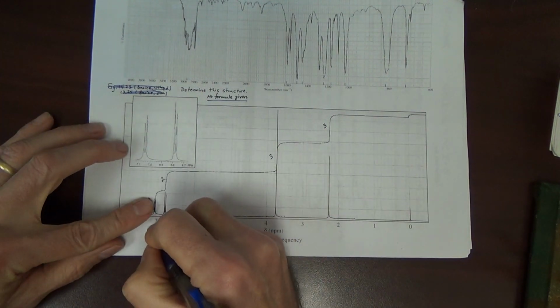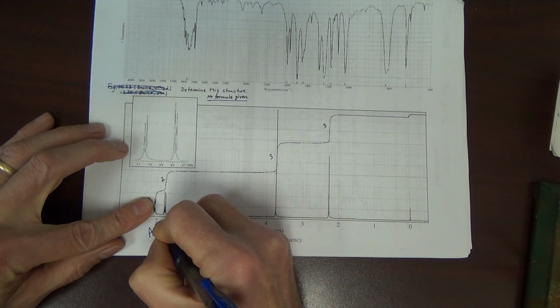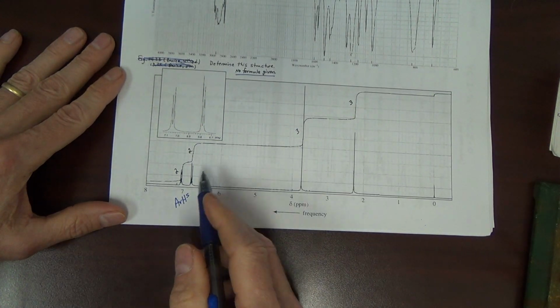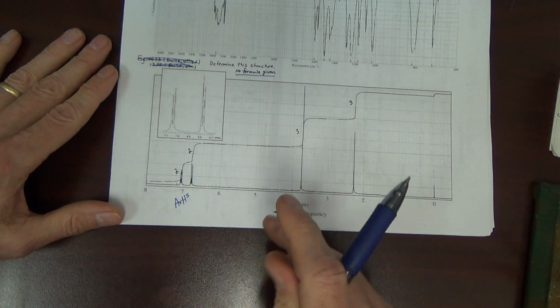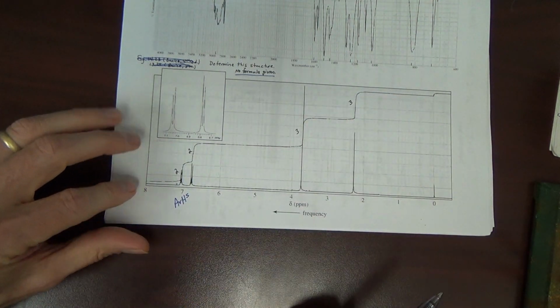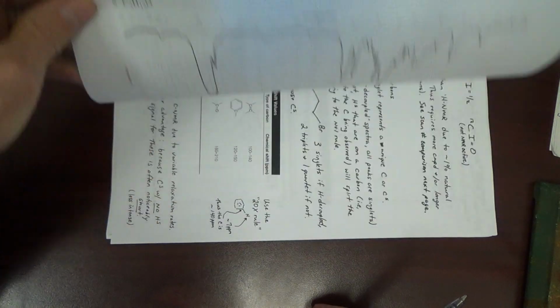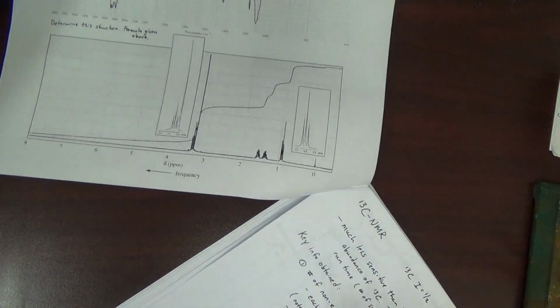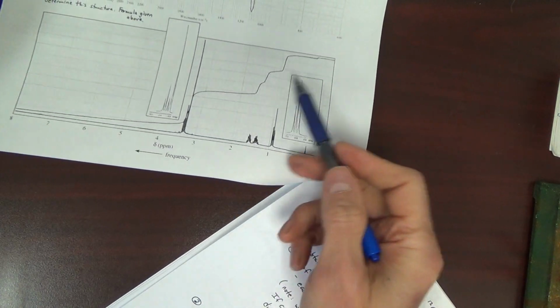I see aromatic H's. How many? Again, integration has been given. I kind of wish I didn't give you this integration so much. Oh, good. The next one you have to do integration on your own.